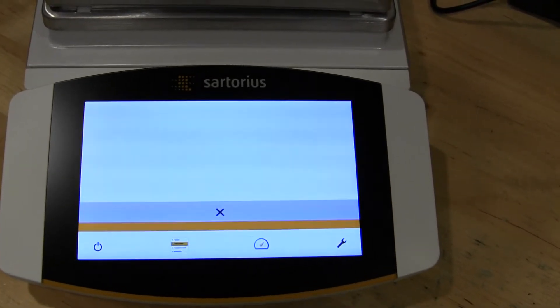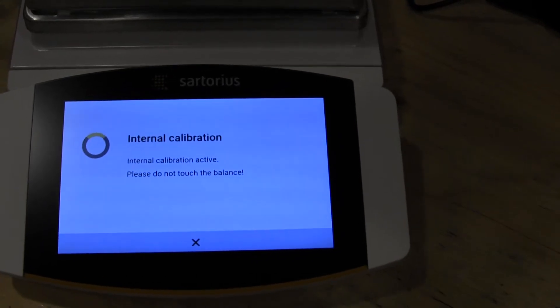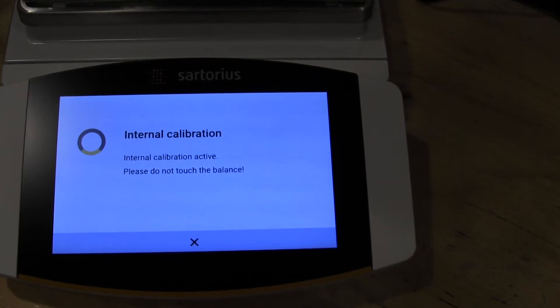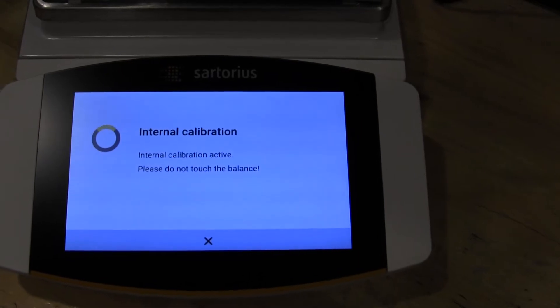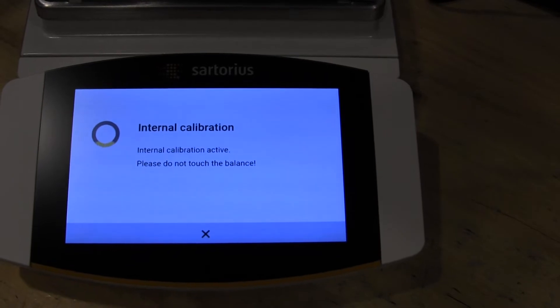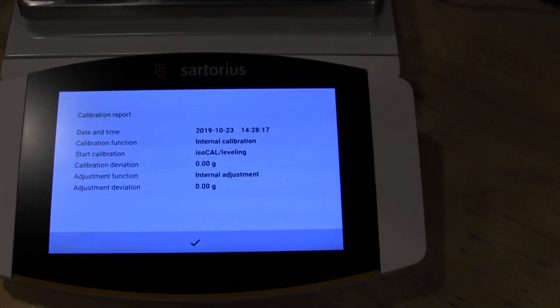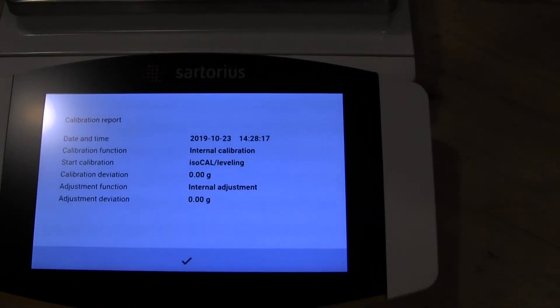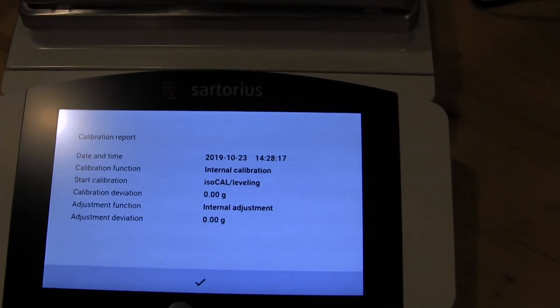Simply select internal cal and you'll hear that servo motor drop in the weight — it's doing the internal calibration. And there you go. You can see from the last calibration the adjustment was zero, and it shows you the date and time.